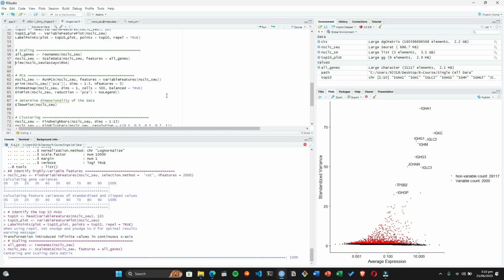I exited my Linux terminal as well, so it can focus on itself. And it has used a 40,000 megabyte file as well, so it's going to take a lot of space.